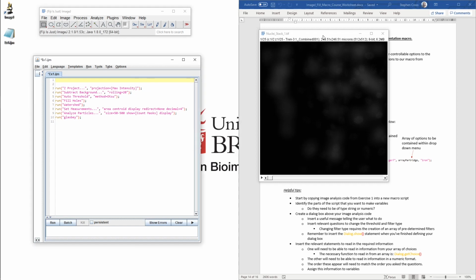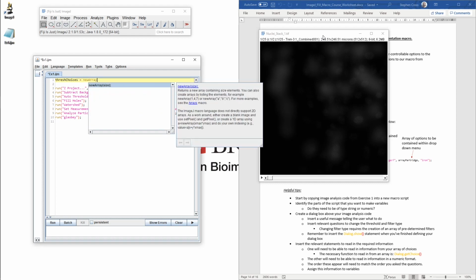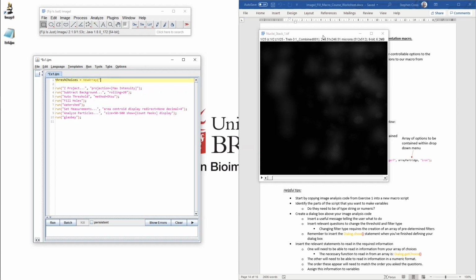So we'll do thresh choices equals new array, what did I say, Huang, ISO data, Li, and Otsu.